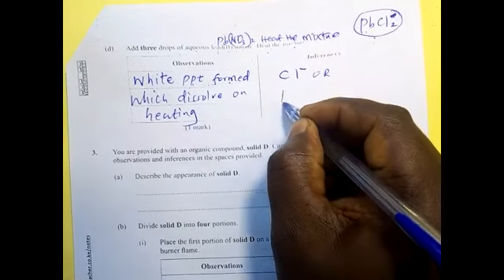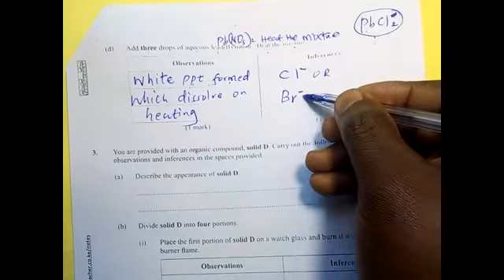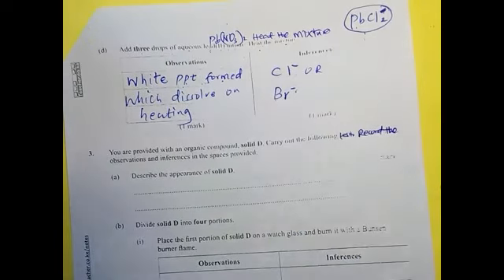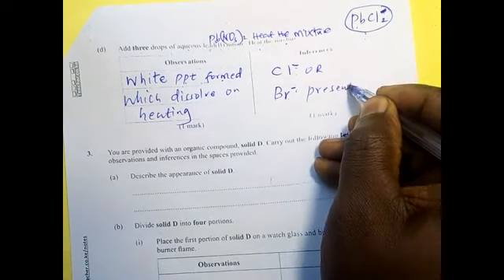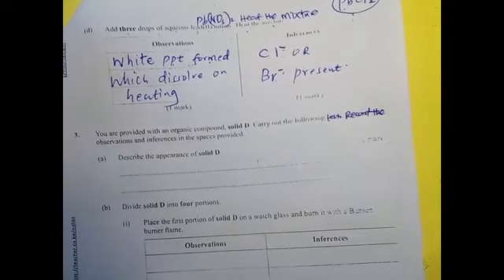You can also use bromide ions. So bromide ions and the chloride ions will behave in a similar way, because actually they are halogens, you can see. So these two will behave like that. So you say this or this is present, and you get your marks, all of them like that.